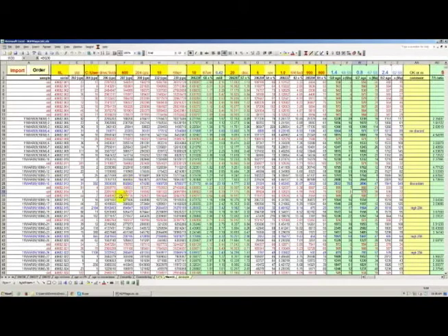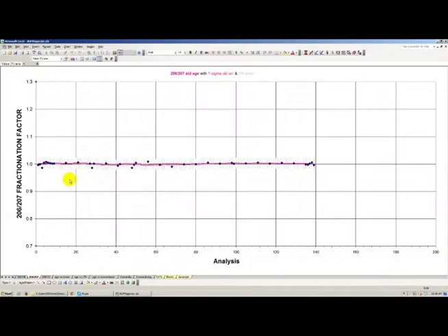throughout the run. Just so you can see that visually, if you go to the 206/207 tab down here, the 206/207 is usually way more stable because we don't have any inter-element fractionation effects during ICP-MS measurements of the lead ratios. So you see that there are 2, probably 3 with this one, 3 standards that have a noticeably different 206/207 ratio.